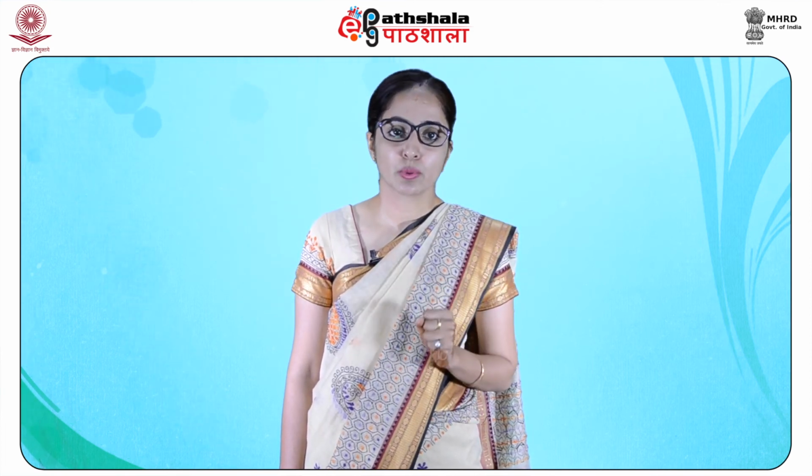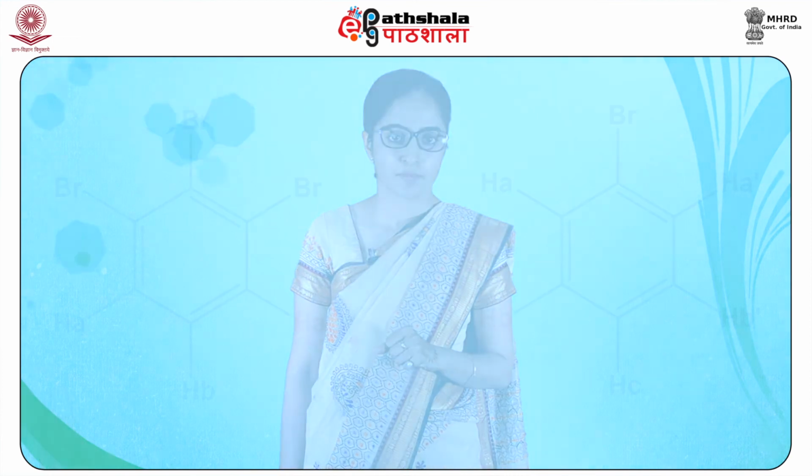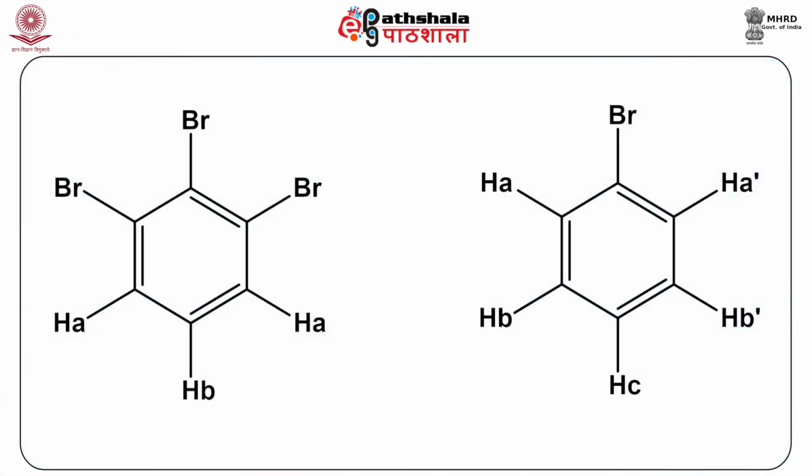Thus, all the magnetically equivalent protons are chemically equivalent, but vice versa is not true. In the Pople nomenclature, such magnetically inequivalent nuclei are given an AA' designation. Such kinds of systems do not give first order splitting patterns. Now, let us take a few examples to understand the concept of magnetic equivalence.